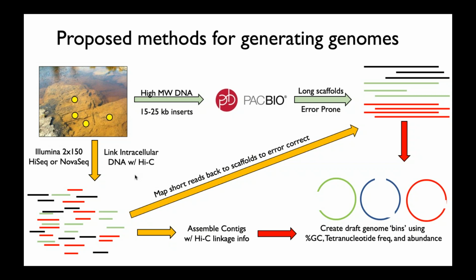And so really thinking about trying to reconstruct these diatom genomes, which are going to be very complex overall. That's sort of how we're starting to think about going about the assembly of these very complex eukaryotic assemblages.